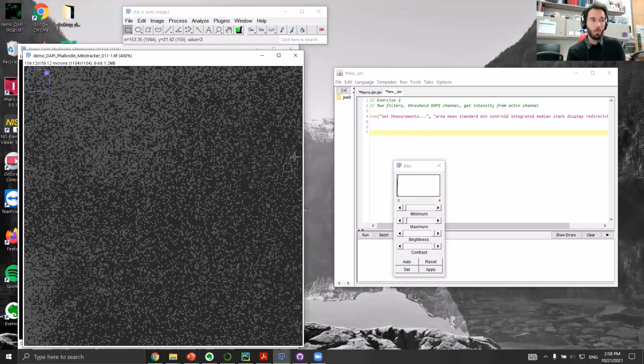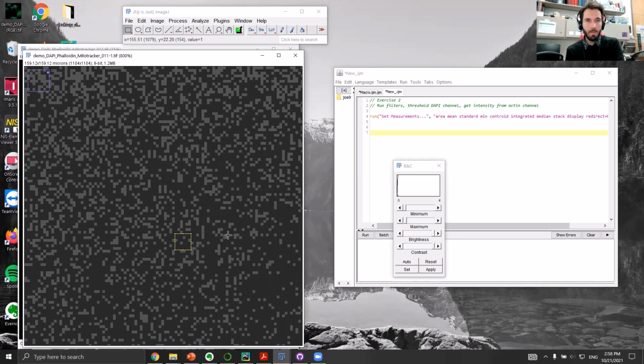One that is handy for denoising is a median filter, and that is maybe more intuitive than what you'd expect. If we have a pixel, say this one here, and we want to apply a median filter, we can say, okay, instead of having this pixel here, which is a little bit brighter than its surroundings, why don't we just give it the value of the median of its surroundings? Usually that's an okay assumption to make, just to reduce noise a little bit, in the context of processing to be able to generate objects.